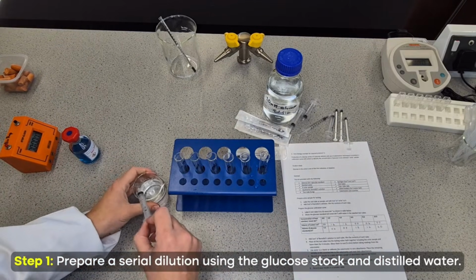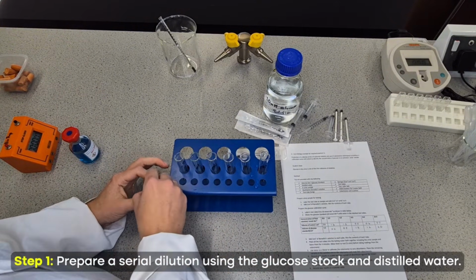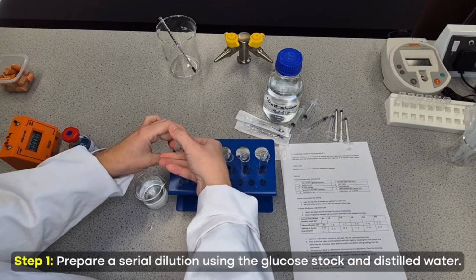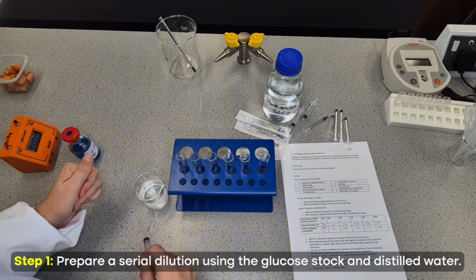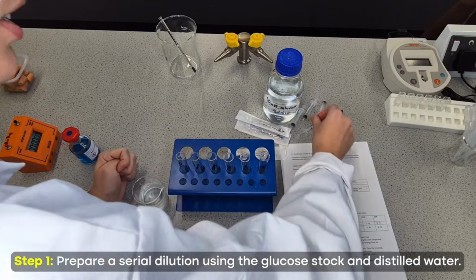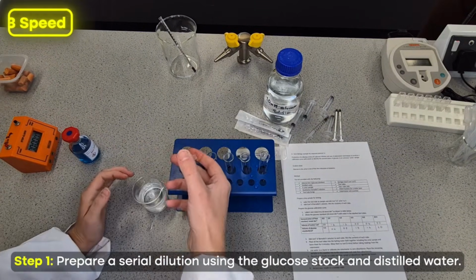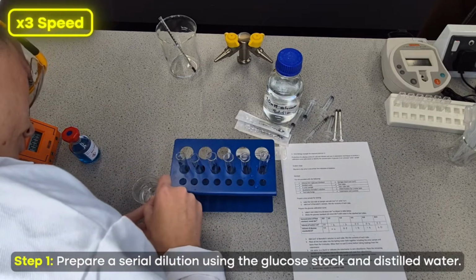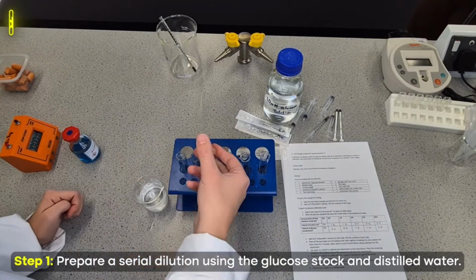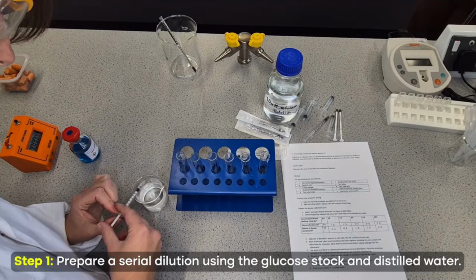So I'm going to add in water to all of them first, and this one here is 2, it's just water. So I'm going to add in my 2. That one is 1.6. So I'm actually going to swap over to these now to get more accurate measurement. 1.6. That's 1, and then this one will be plus 0.2.